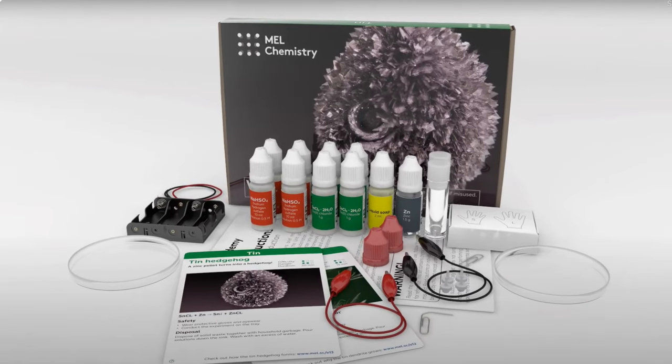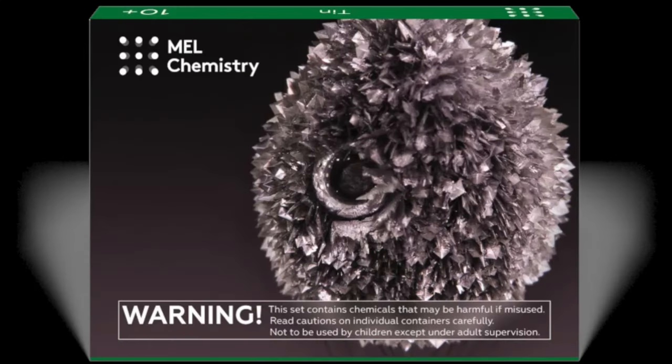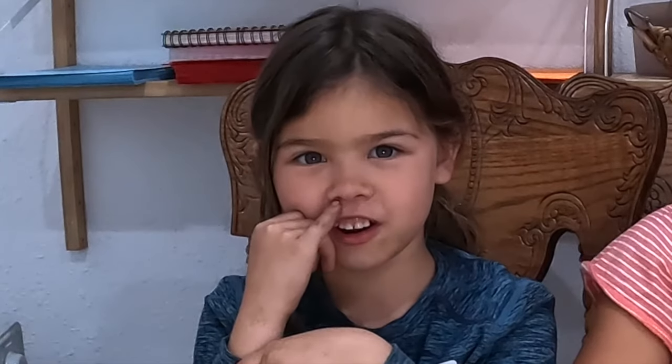Hi everyone, today we are going to be doing a science experiment from Male Science. Male Science has tons of science experiments and this is our very first one, so I hope it works out. This science experiment is called a Tin Hedgehog — we have a zinc pellet that forms into a tin hedgehog. What's a hedgehog? This is a hedgehog!